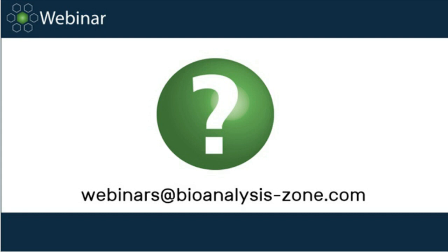Thank you. Okay, that's great. Question number 2: does the number of samples that need to be analyzed impact the level of validation? Let's say one clinical trial requires 30 samples to be analyzed and another 3,000 samples.